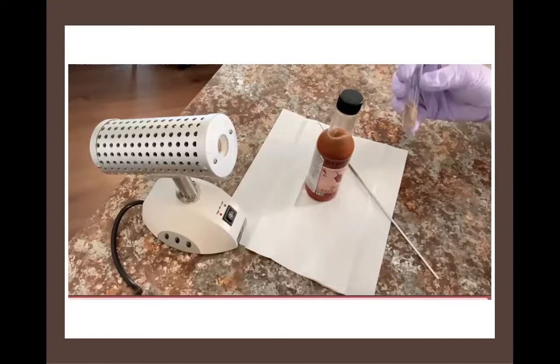Now, when we're working with a glass test tube, we can take an extra step to protect the sterility inside that nutrient broth tube. And that's to flame the mouth of the test tube when we open it, before we handle it, before we put culture material in, and also flame it again before we close it. Now I'm going to show you what I mean by flame it. This is something we can do using aseptic technique to add an extra layer of protection against contamination.